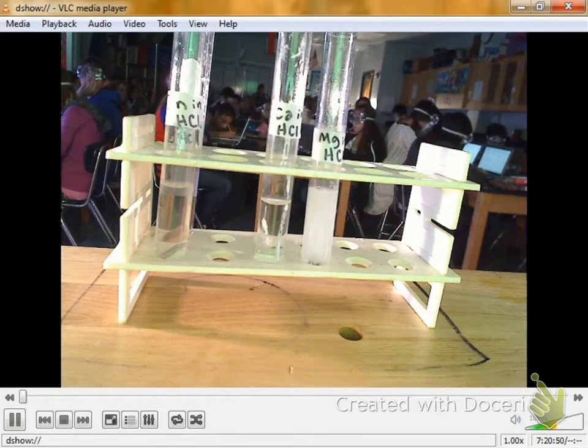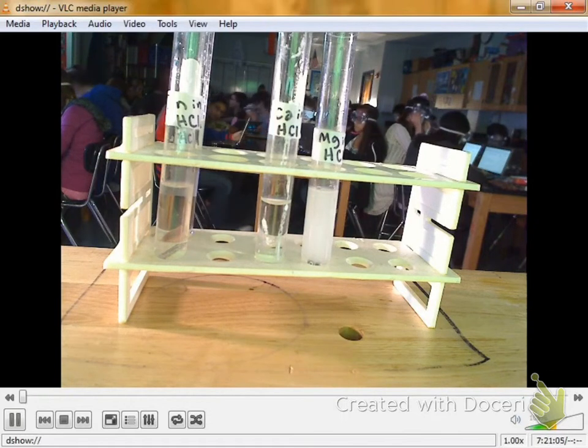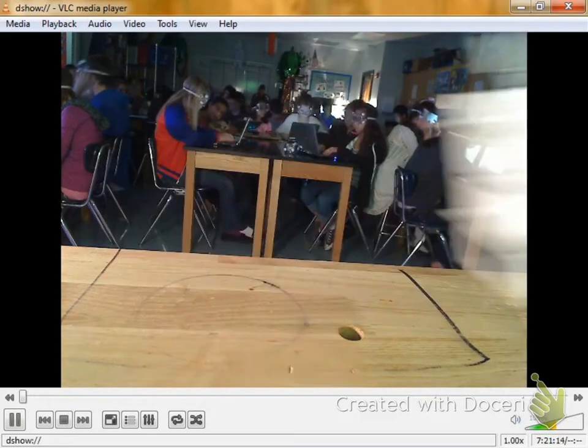Calcium. It's going down here. Is it going to explode? Well, let's see here. Now, calcium, where is calcium on the periodic chart compared to magnesium? Directly underneath magnesium. Well, I like your answer, Xander, directly underneath. What was one of the characteristics of our group 1 and group 2 metals? Were they hard?